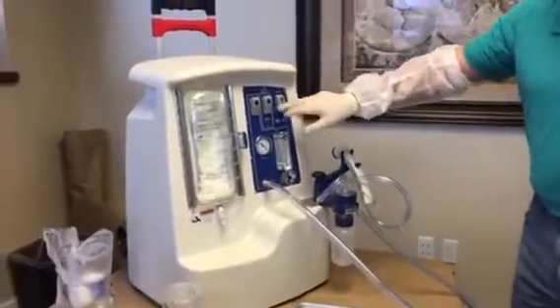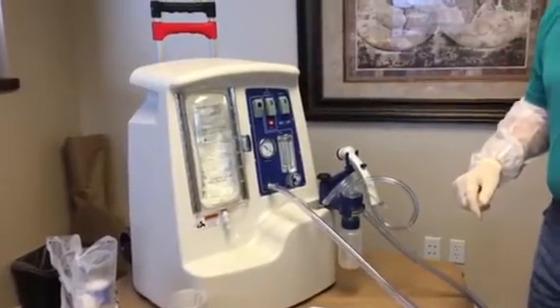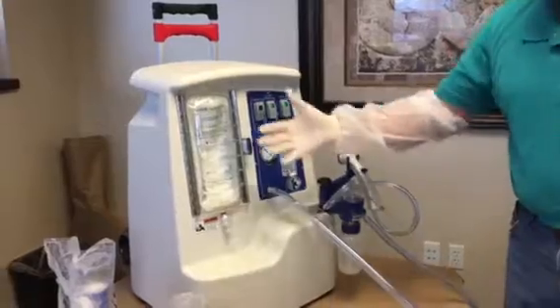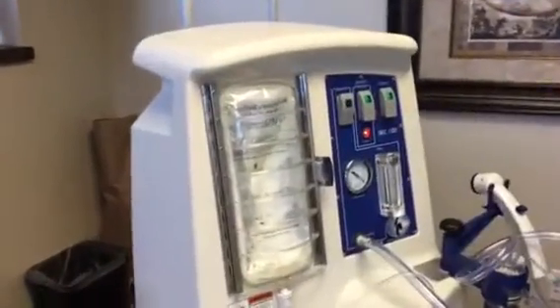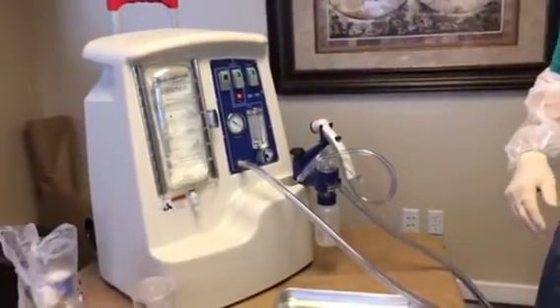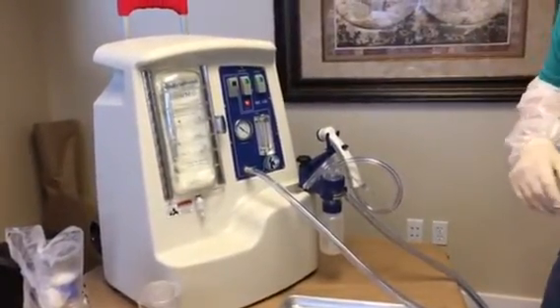We are now ready to take a sample. First thing you do is power it up, you pressurize the solution — you can see it actually has a bag behind it — it pressurizes it against this door and that gives a nice steady flow of liquid. Then once it's fully pressurized, we can turn the vacuum on and take a sample.